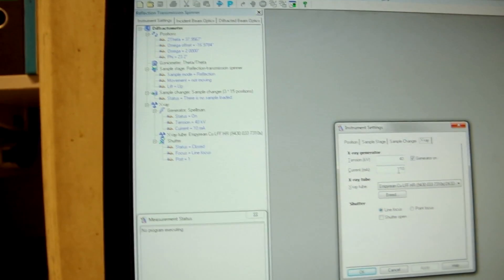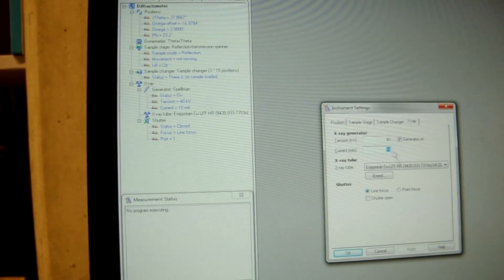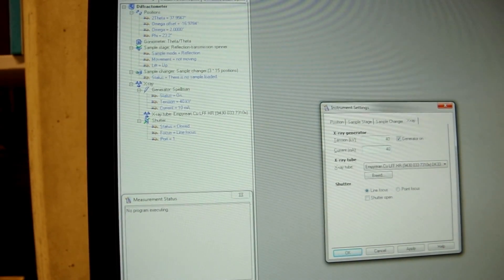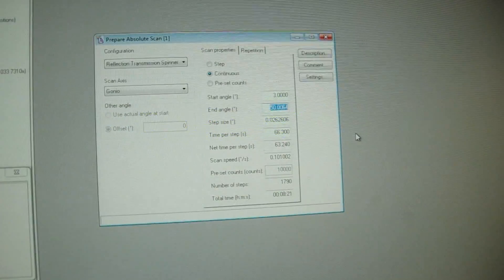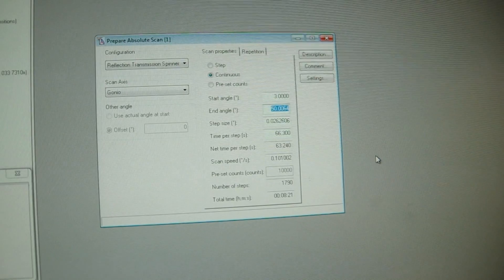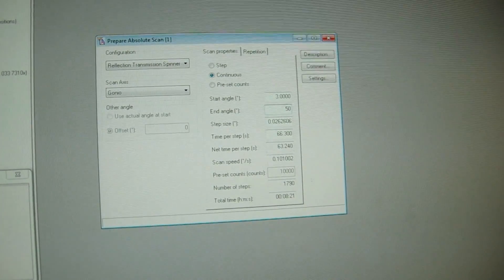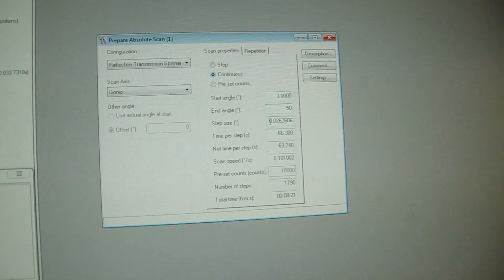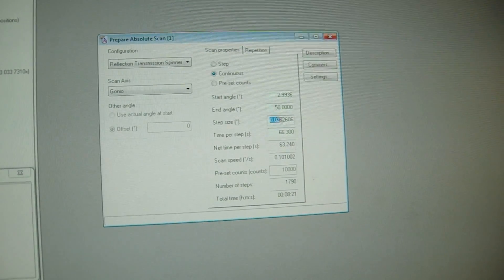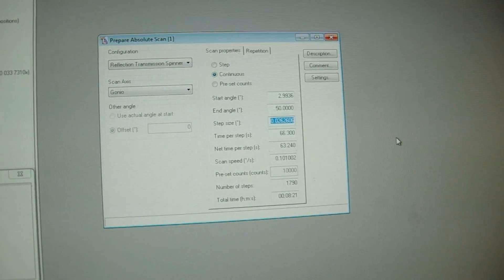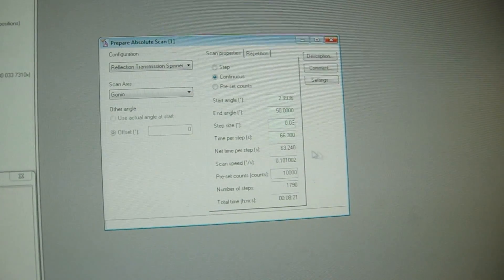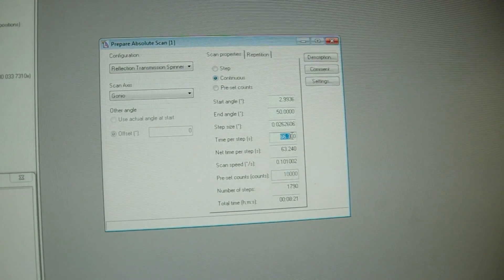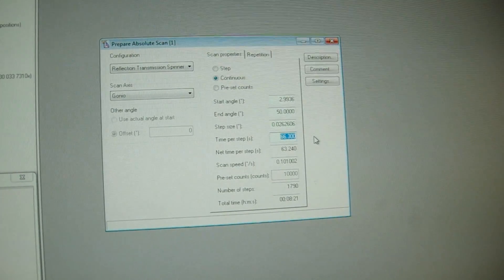To begin the measurement, the beam current is adjusted to 40mA. Different measuring programs can be set up in absolute scan. The start angle, end angle, step size, time per step, scan speed, etc. can be optimized to achieve best results. Generally, smaller step size and longer scanning time gives better results.